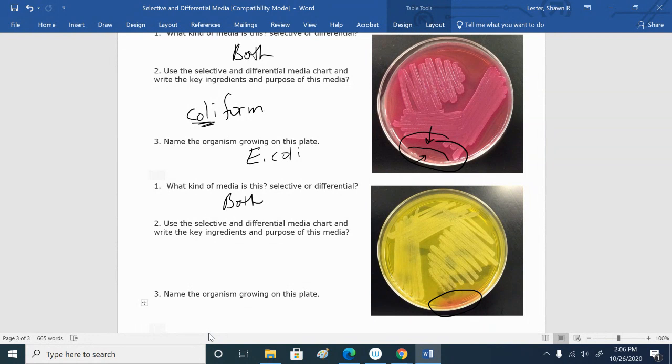As you see here, we just have a little bit of the original plate color left. If you let this incubate one more day, the entire plate is yellow. All the acid has diffused all over the place. So remember I said we only use this plate to grow what genus?